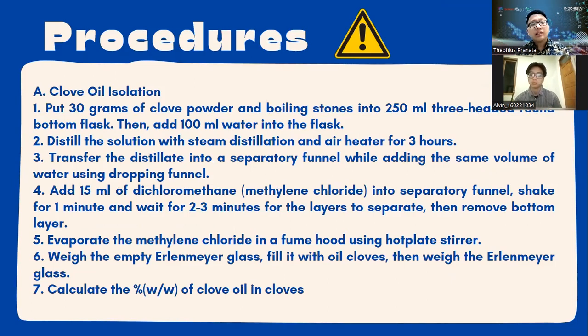One is clove oil isolation, and the second part is the TLC, or thin layer chromatography.